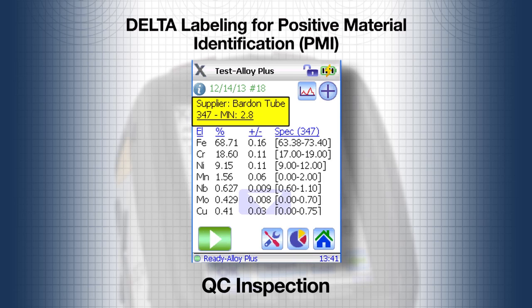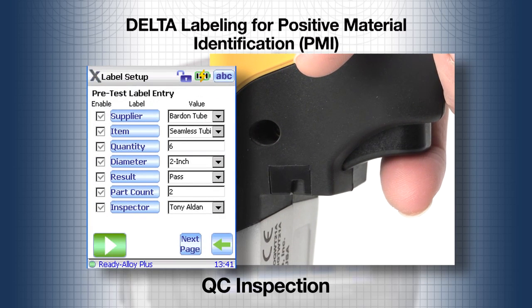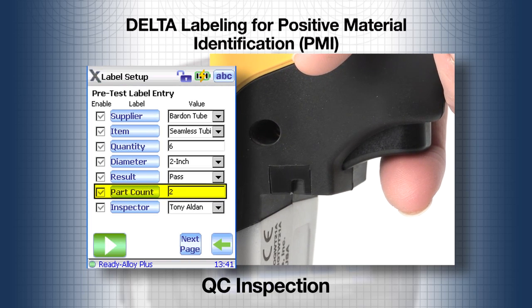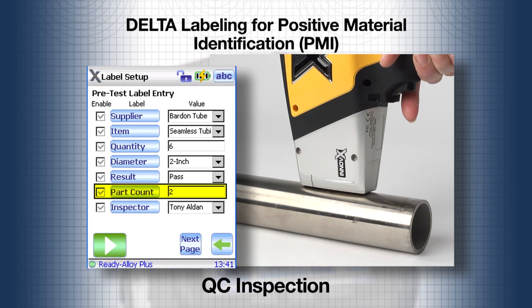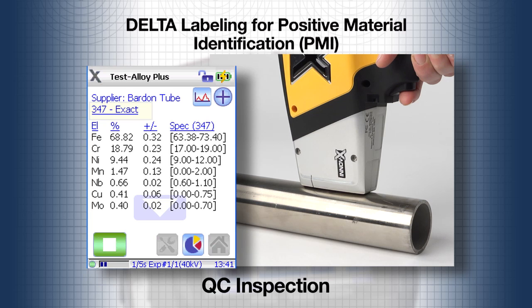The result also shows the supplier field from the label window. The Delta chooses the first label as the default, but you can change which label appears on each test. When the trigger is pulled to start the next test, the label window comes up and the part count increments to show that the second part is about to be tested. Pull the trigger and the test commences — the second tube is also the expected 347 grade.